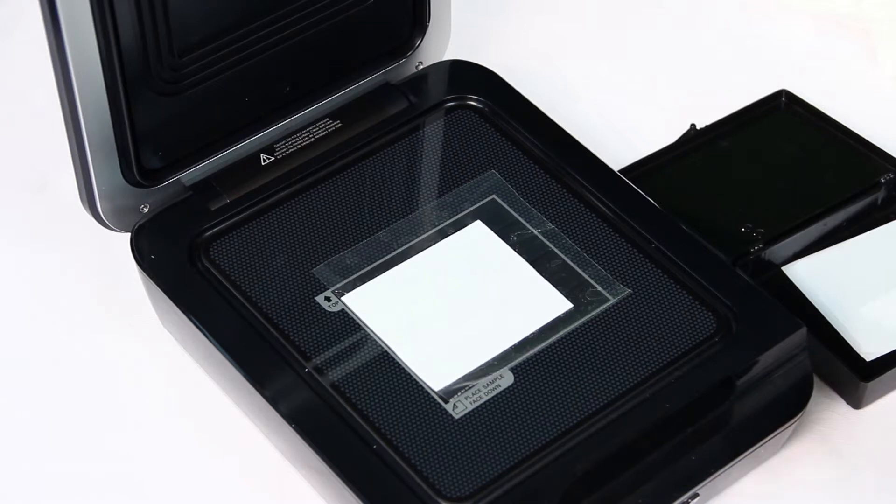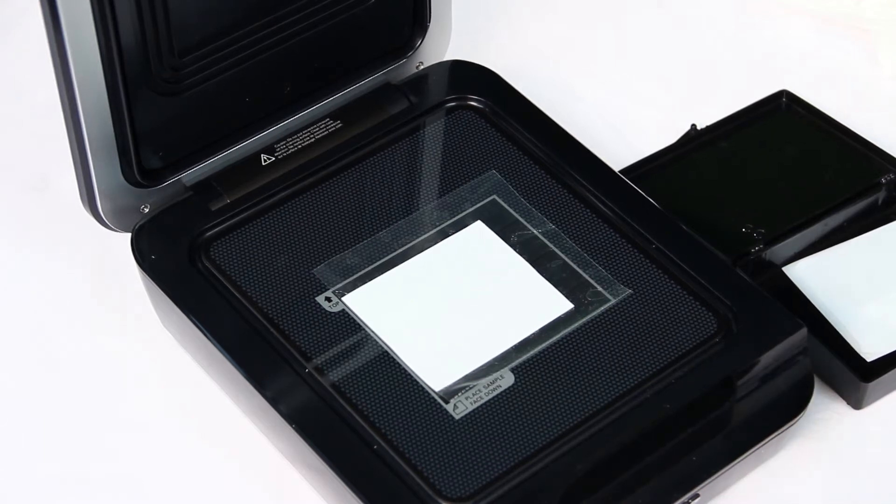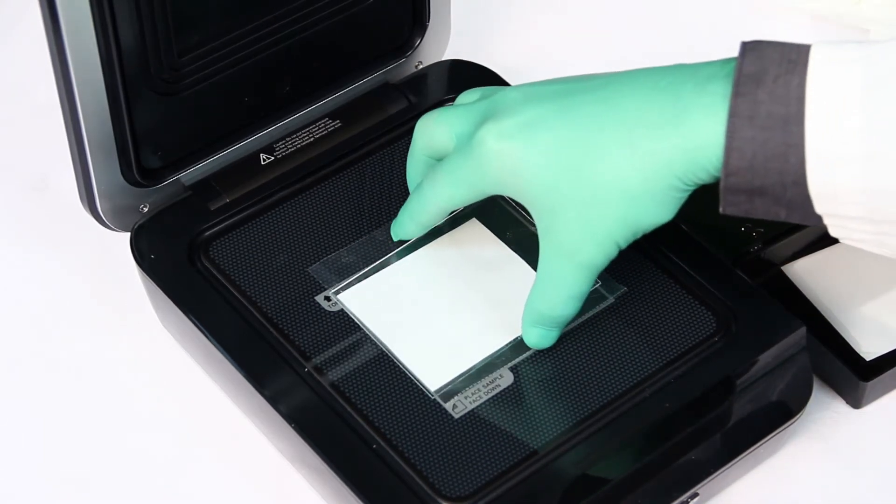If a plastic sleeve is used, it is recommended to place something on top of the blot in order to keep the blot flat. A glass plate from a mini-gel works well for keeping the blot flat.